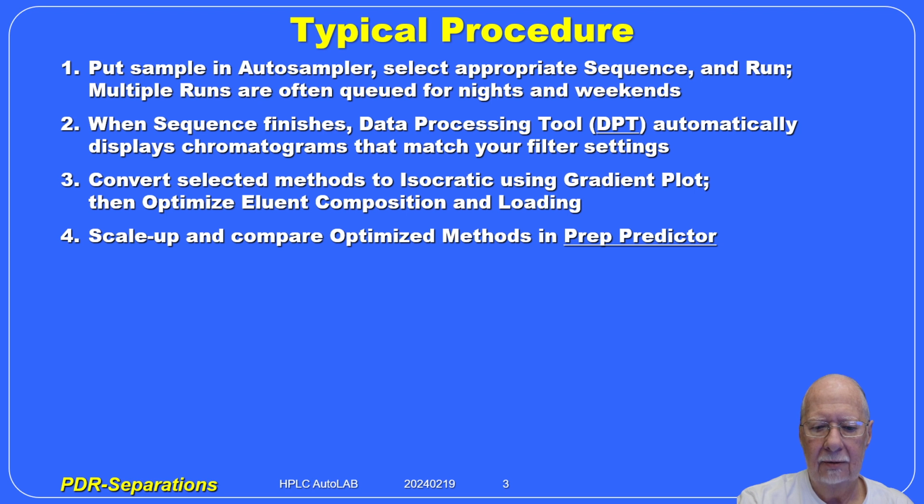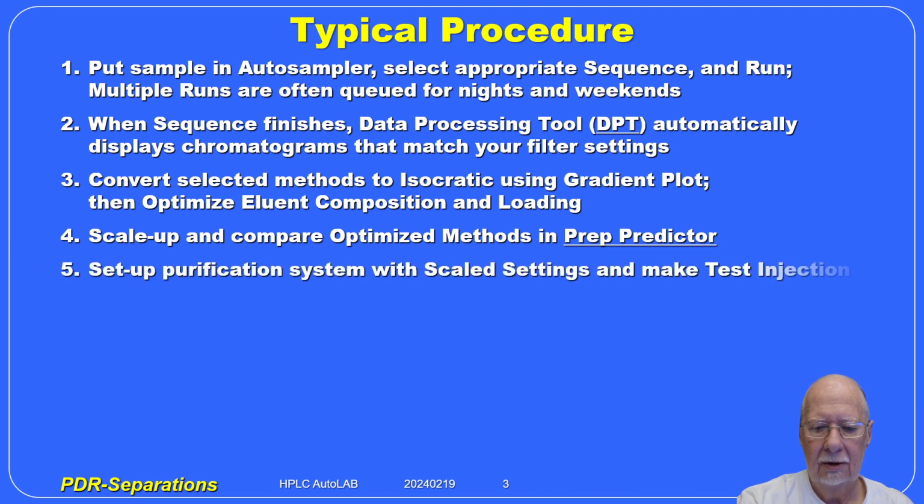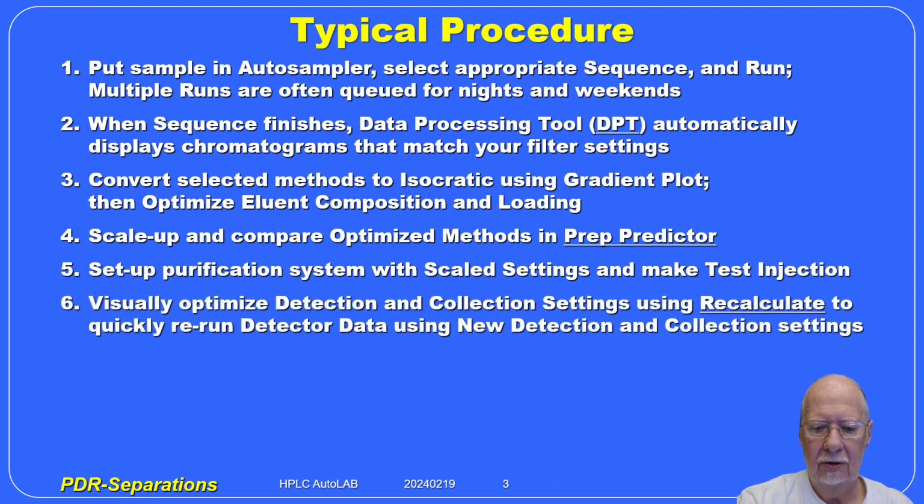Scale up and compare optimized methods in PREP Predictor. Set up purification system with scaled settings and make a test injection. Visually optimize detection and collection settings using Recalculate to quickly rerun detector data using new detection and collection settings.